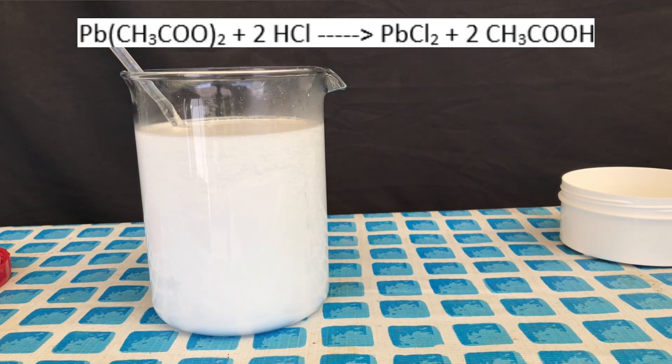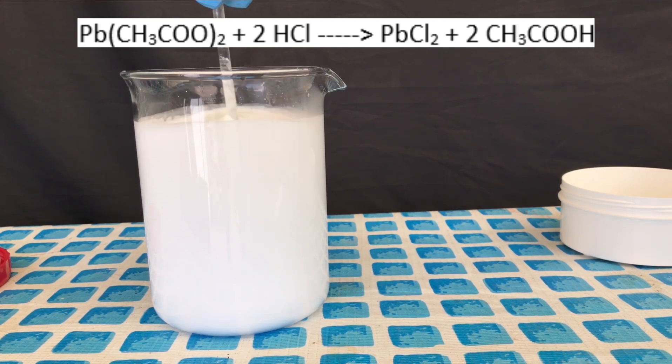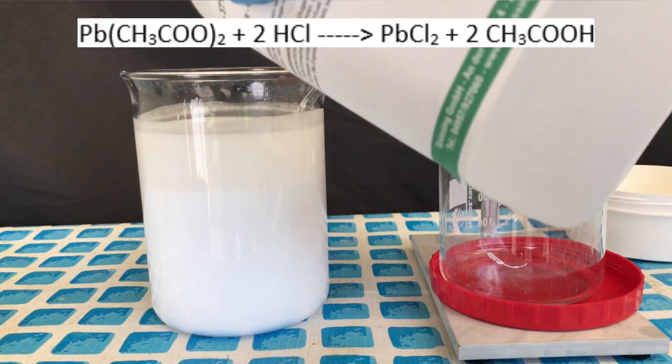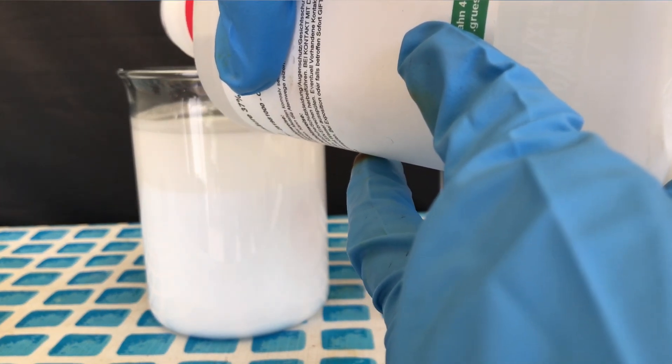The reaction taking place is the following: lead acetate reacts with hydrochloric acid to form insoluble lead(II) chloride and acetic acid. In reality the reaction is not as simple. Everything except the lead(II) chloride is in solution in the form of ions. It's barely visible but two layers have been formed here.